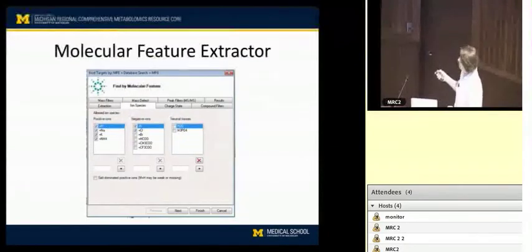There are a lot of other events that happen in mass spectrometers. You get what are called adducts. In other words, you need some kind of a charge to be able to detect the ions. So in positive ion mode, you either get that charge through protonation, or there might be other events. If you're using any kind of glassware anywhere in your process, you're likely to get sodium and potassium.